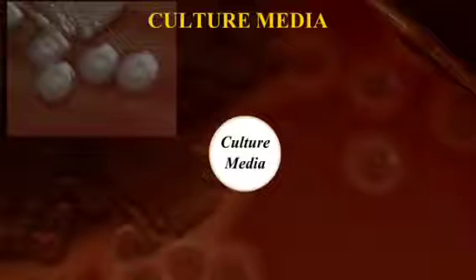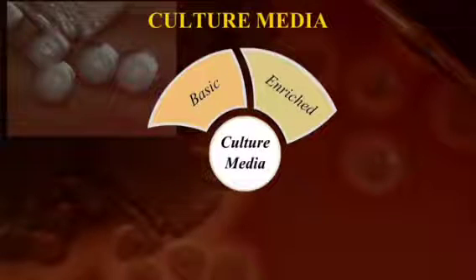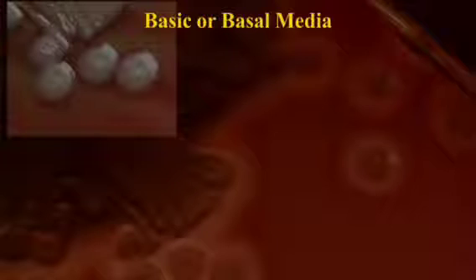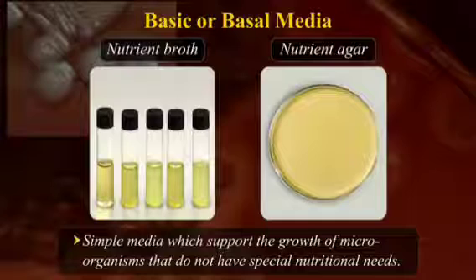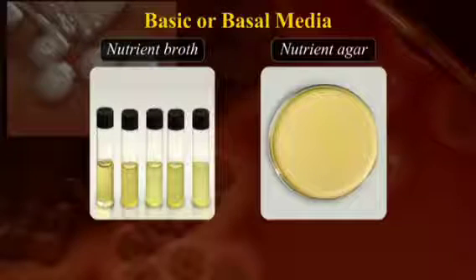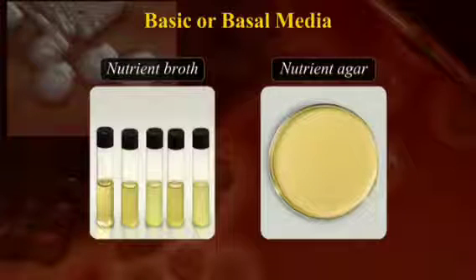Culture media can also be classified as basic, enriched, selective, indicator, and transport. Basic or basal media. These are simple media which support the growth of microorganisms that do not have special nutritional needs. Examples are nutrient broth and nutrient agar.